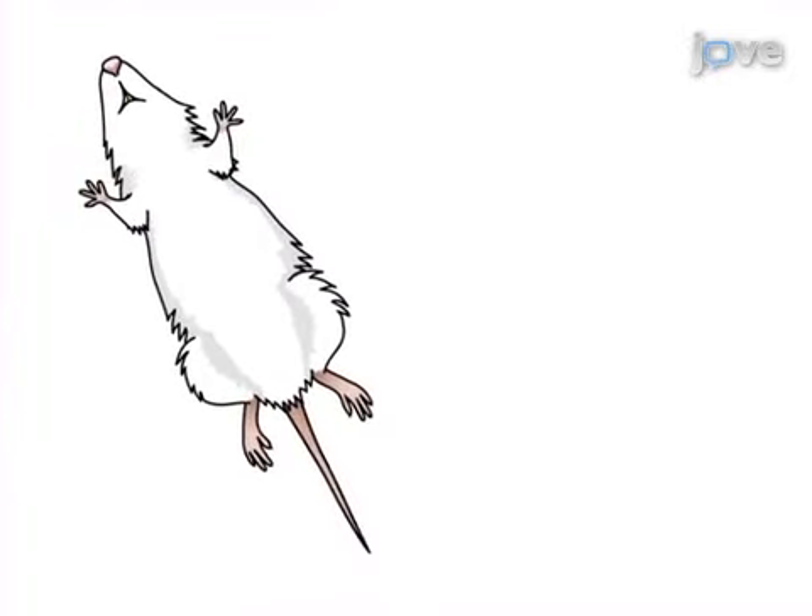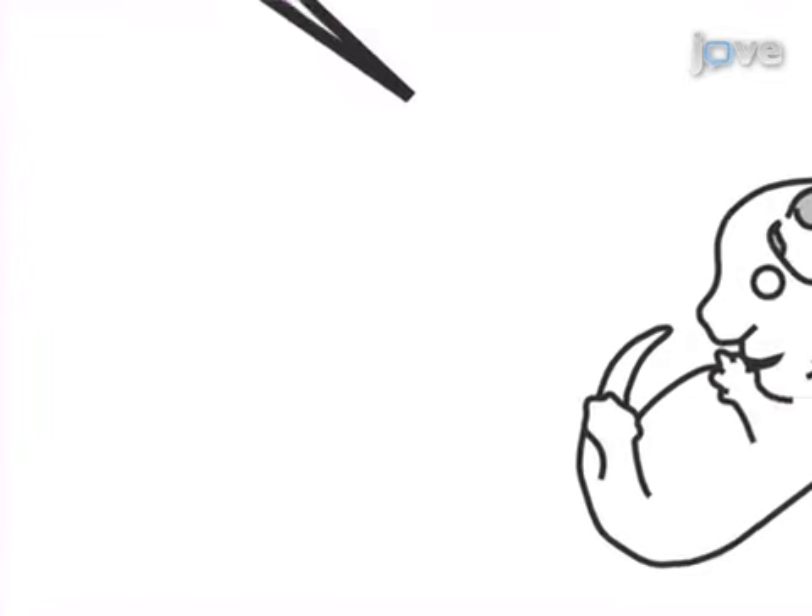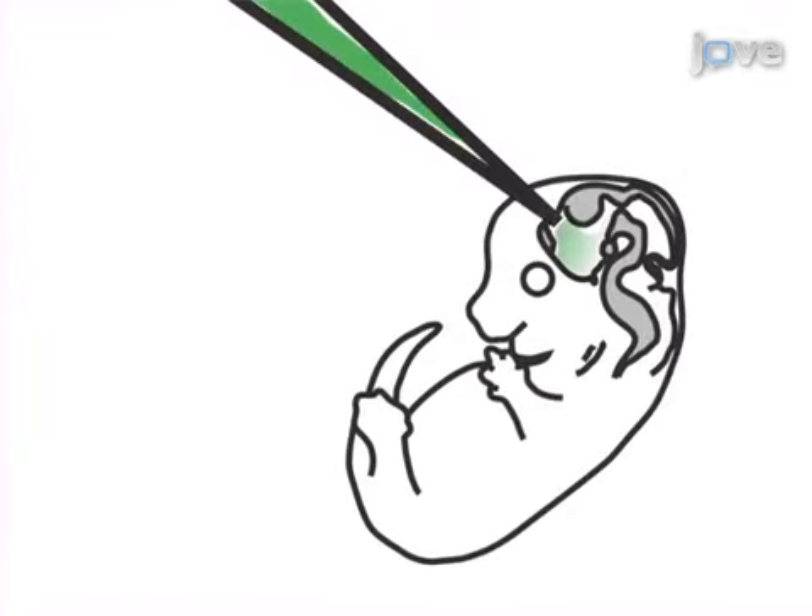This is accomplished by first anesthetizing the pregnant mouse and exposing the uterus through laparotomy. The second step is to inject the DNA solution into the third ventricle of the embryonic brain.